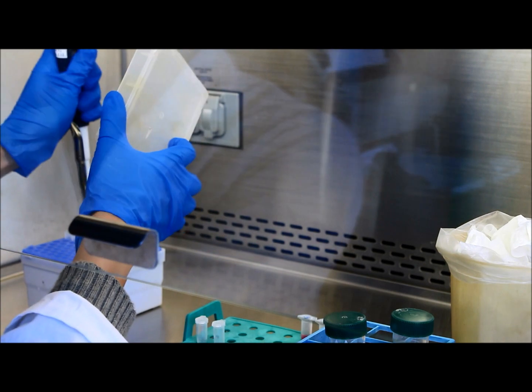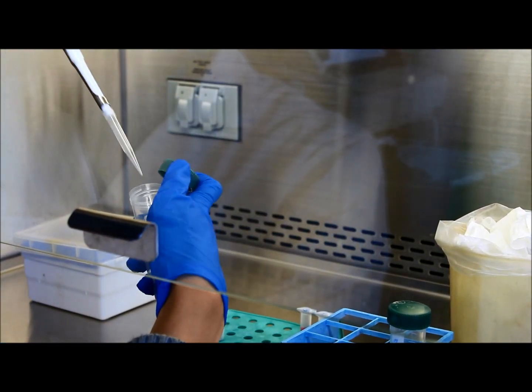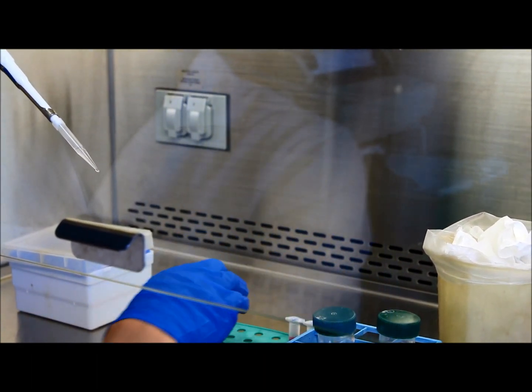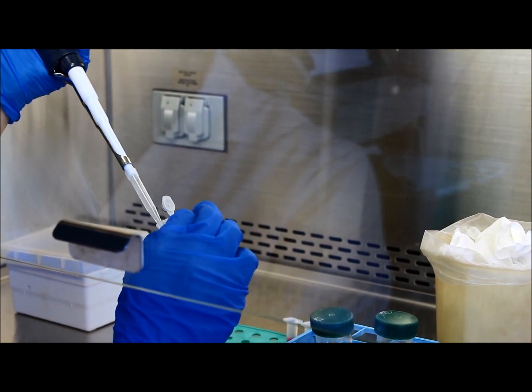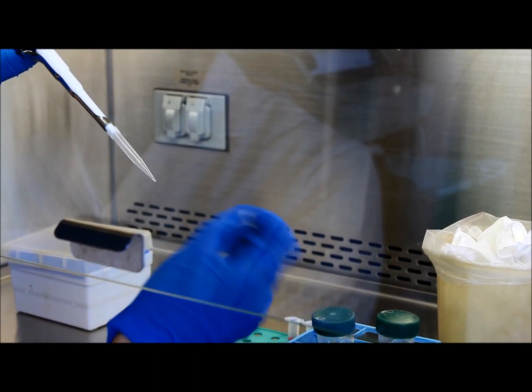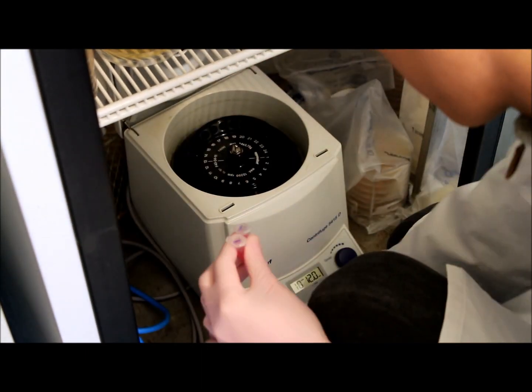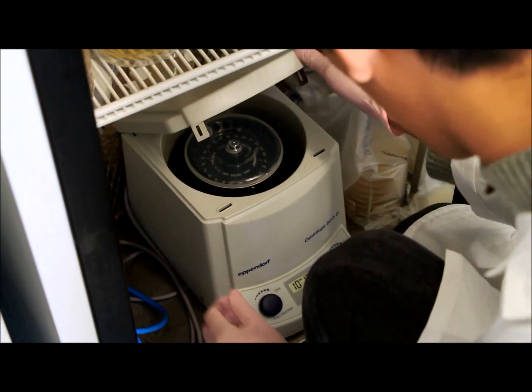The next step is the RNA precipitation step. 100% isopropyl alcohol is added and incubated for 10 minutes. Then there is another centrifuge step at 12,000 G for 10 minutes at 4 degrees Celsius.